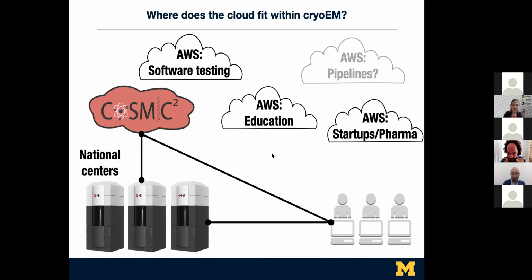Another logistical question: can you continue refinements or classification jobs after they finish? How stop-and-restartable are things when you're running in COSMIC? Right now it's more of a submit the job, run it, get the results.